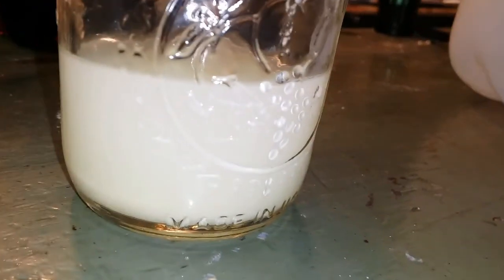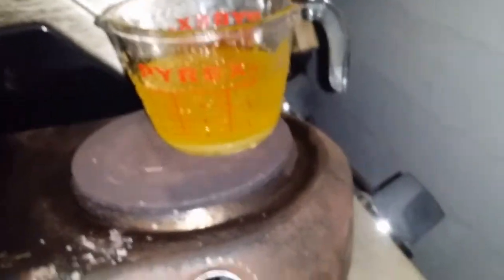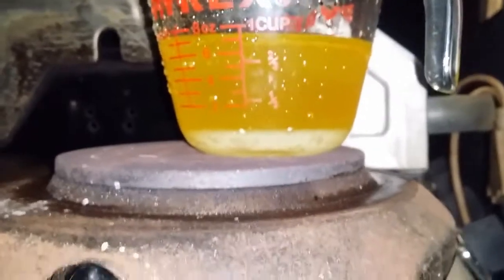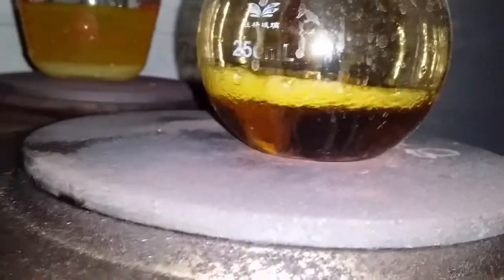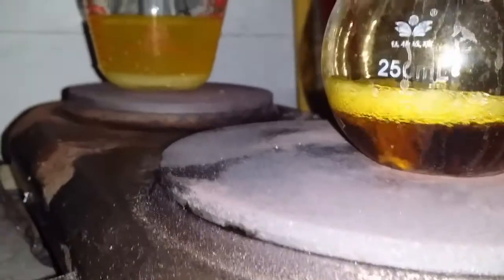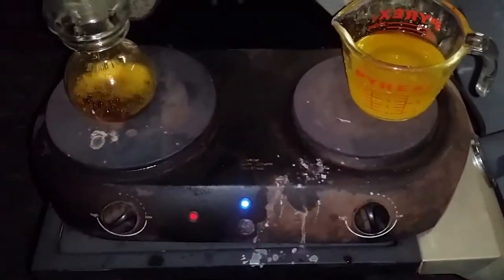So whatever that was in the solution I had saved, whatever that salt, whatnot it was that precipitated out, kind of figured that one out later. It's mostly clear. The droplets you're seeing on the outside is from me washing it, of course with distilled water. There's still some in the bottom. I'm probably gonna have to do it again. This thing is still going. I probably won't record all of the washes of this one.